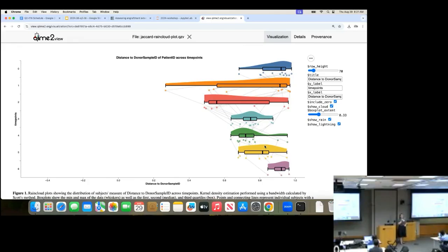I think we do. So what I would do is look at distance to baseline, alpha diversity, some source tracking around those time points, and see if I can prove that this microbiome isn't like their baseline anymore, but is just a unique microbiome developed after FMT intervention.